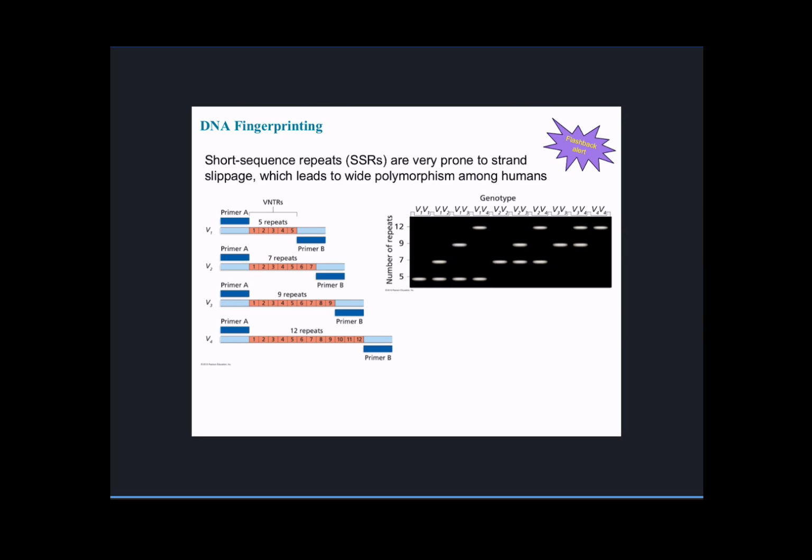So this is a real-life use of the fact that primers may attach to the same regions in DNA of different individuals, but they may have different lengths of sequence separating them, which you can use to your advantage. So not only do you determine whether or not a given sequence is present in a sample, but what type of sequence is present in those.